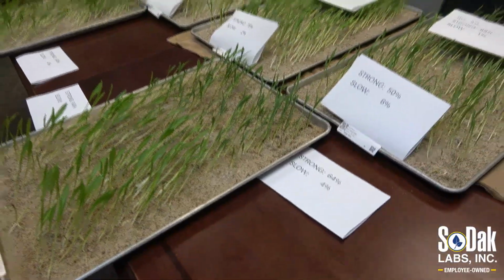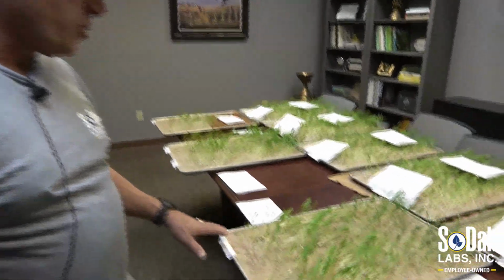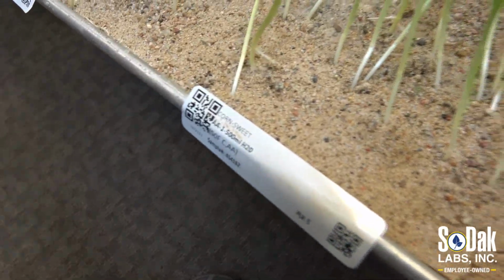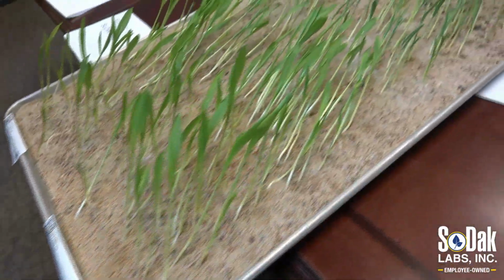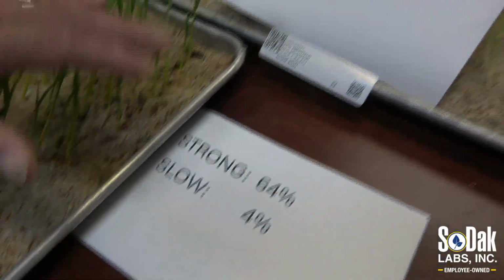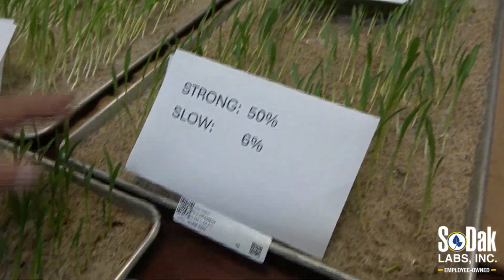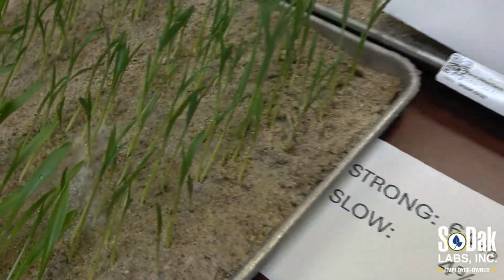So what the lab did is they commonly plant on these larger trays 2 samples. So this sample here is represented on the back half of this tray. You can sort of see the leaf style differences, the morphological differences. This really represents that. The front represents the second sample.